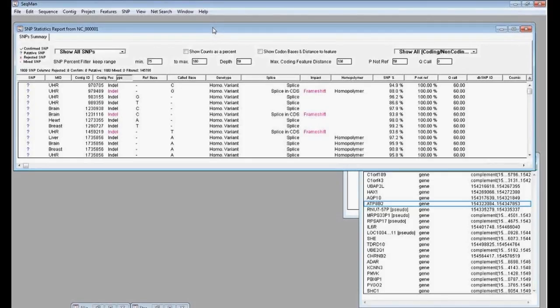There's not. You can use the entire genome, and the aligner is efficient enough to remove the bias, and it will give you the same result whether you're aligning to one chromosome, like in this example, or to the entire genome. I actually had a different alignment for the entire human genome, which I did not open in the interest of time. It takes a few minutes to open up initially. But the results are the same, and there should be no differences.